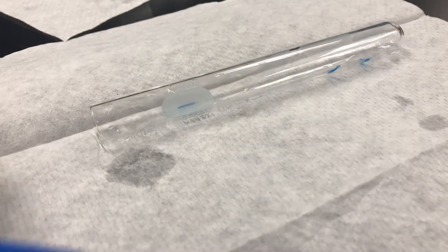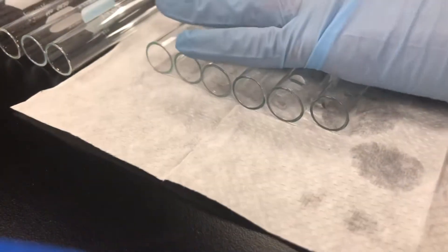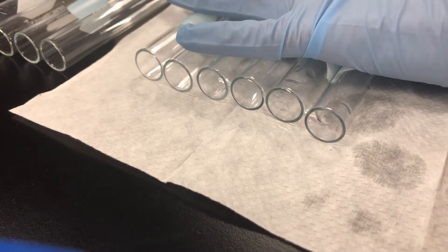A trick to quickly labeling all your test tubes is to take the one you've already labeled and line it up with the other ones. You have to be careful your test tubes don't roll off the bench. I'm going to take the test tubes I have — let's say I need ten of them. I'll take a subset of those that I can line up easily, lining those up at the bottom, and look where my mark was from before.